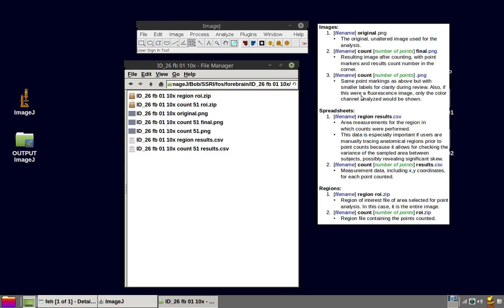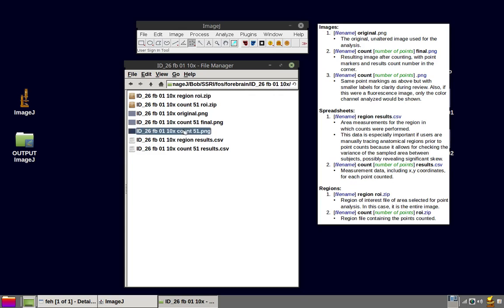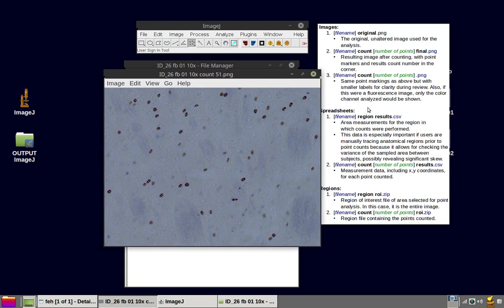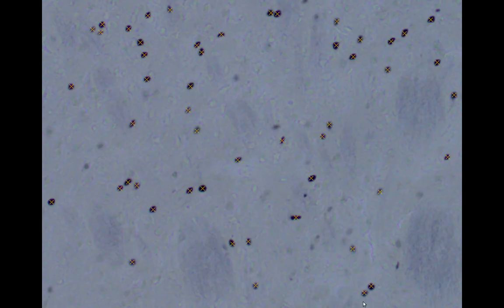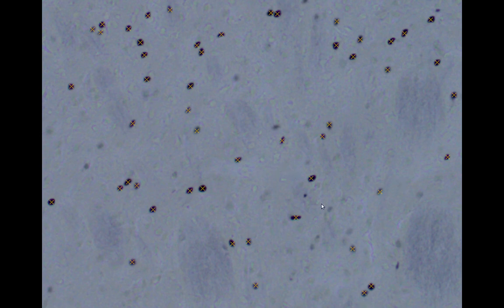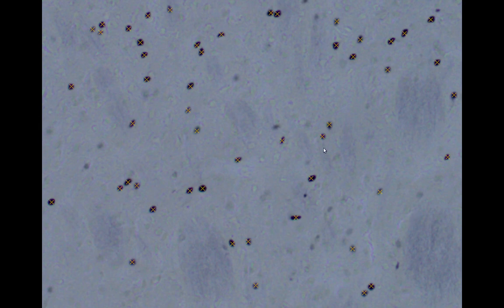And the third picture here is the file name with the word count, but it's not final. There is a number of points. And that image has the same point markings as the one with the word final, but with smaller labels for clarity during review. And also, if this were a fluorescent image, only the color channel analyzed would be shown. You can see here, instead of the yellow masks, you have these light crosses. And you can see what's going on underneath. And this oblong object here can be discussed afterwards.